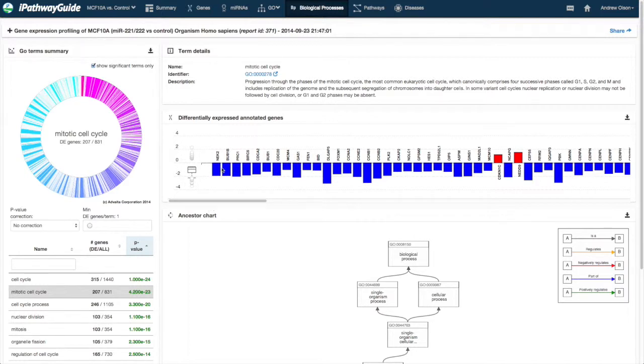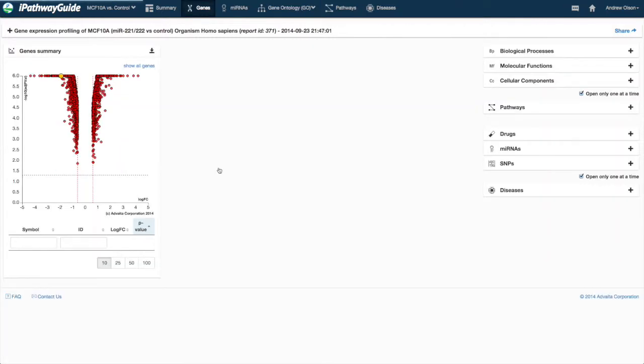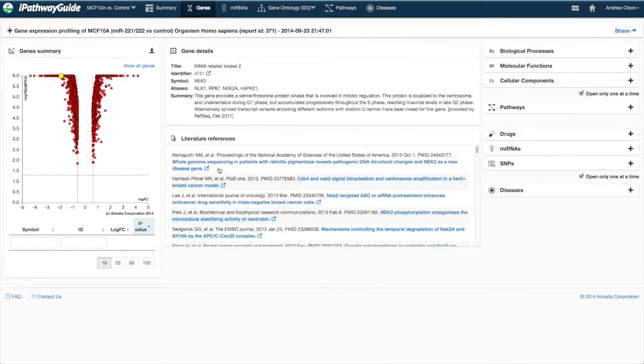Clicking on any one of these bars will take you to the Genes tab with that gene selected.